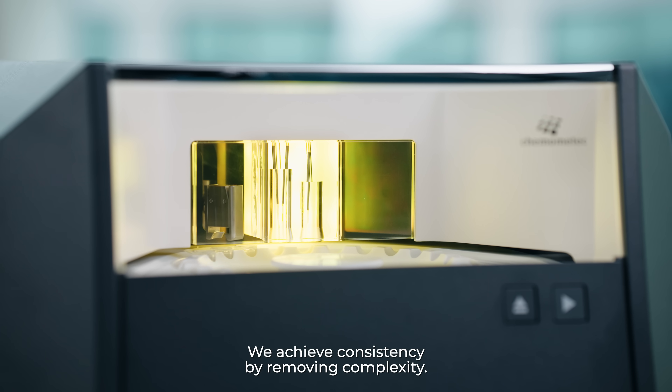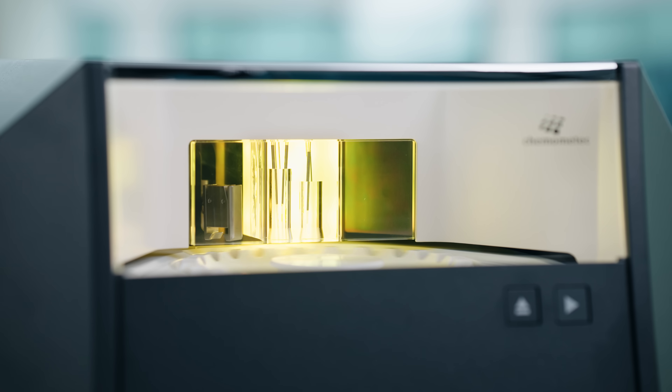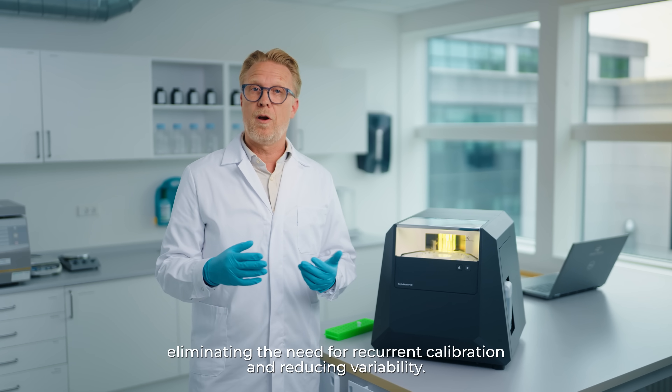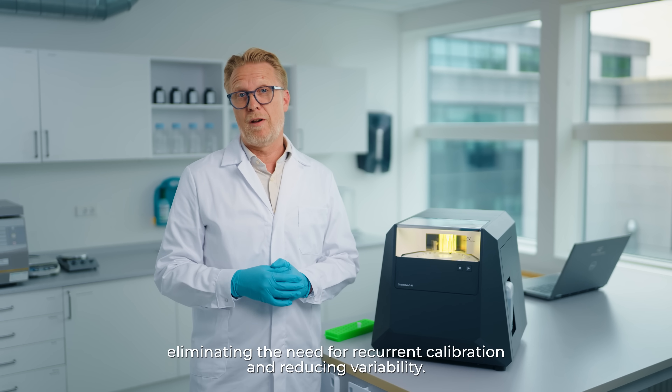We achieve consistency by removing complexity. The XM40 has no moving optical parts, thereby eliminating the need for recurring calibration and reducing the variability.